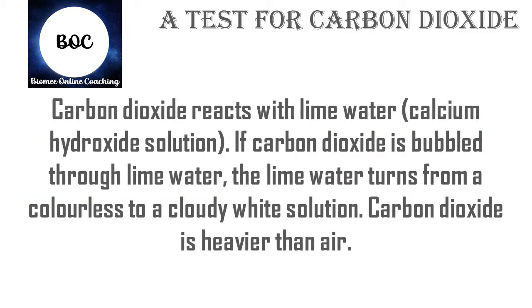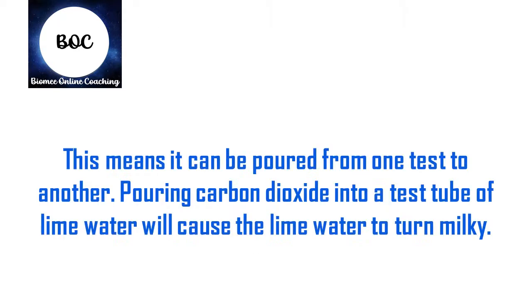A test for carbon dioxide. Carbon dioxide reacts with lime water, meaning calcium hydroxide solution. If carbon dioxide is bubbled through lime water, the lime water turns from colorless to a cloudy white solution. Carbon dioxide is heavier than air. This means it can be poured from one test tube to another. Pouring carbon dioxide into a test tube of lime water will cause the lime water to turn milky or whitish in color.